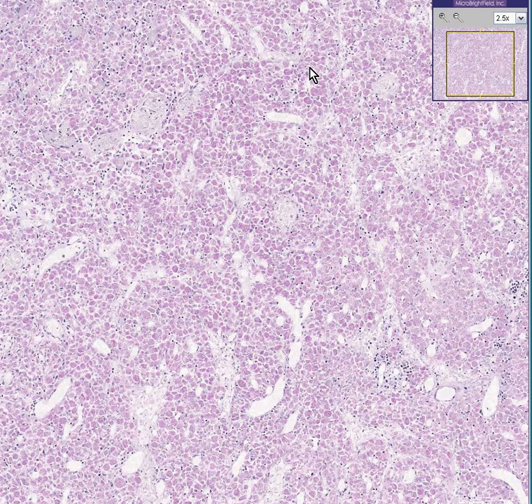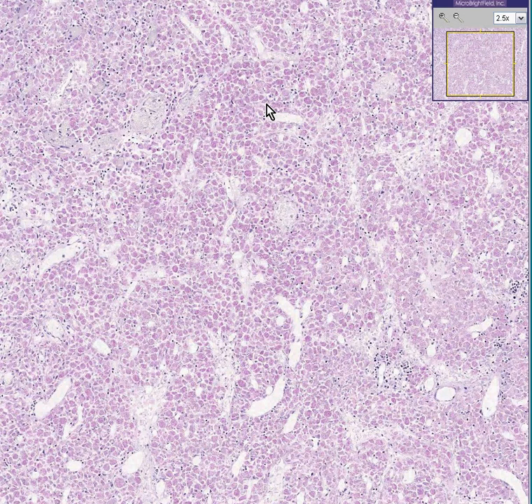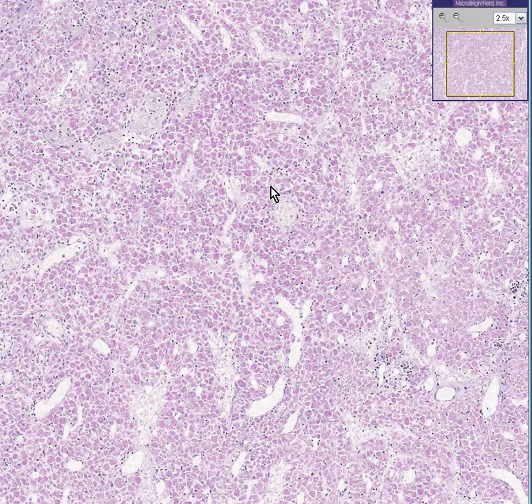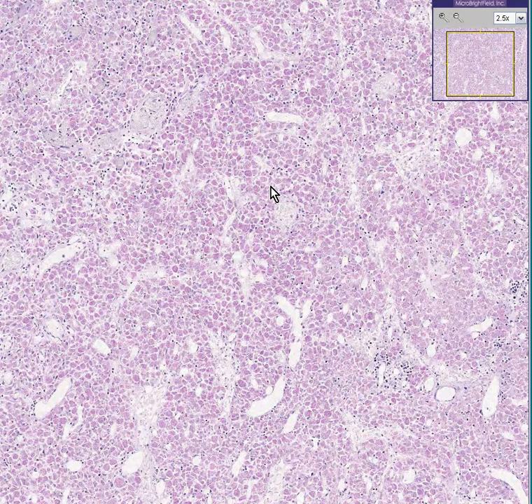This is a special stain called an acid-fast stain, also called a Ziehl-Neelsen stain. It's the most common, historical, and even present stain used to show acid-fast organisms, like TB and all of the atypical mycobacteria, including leprosy, and some bacteria as well. But this is not an H&E stain.